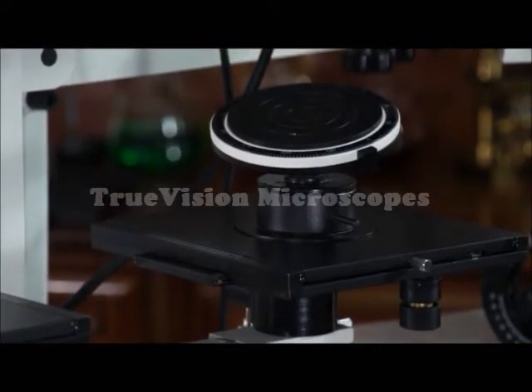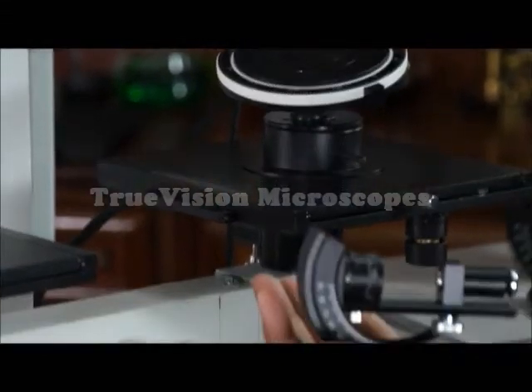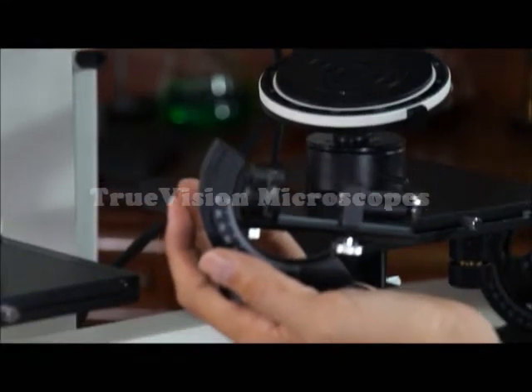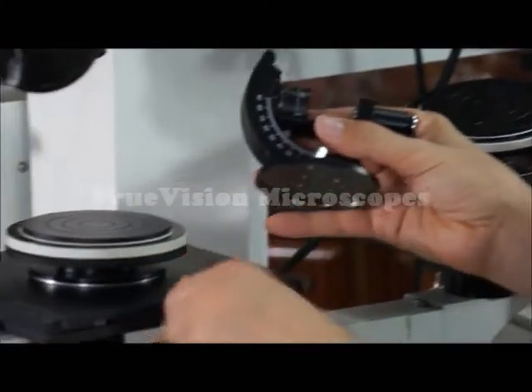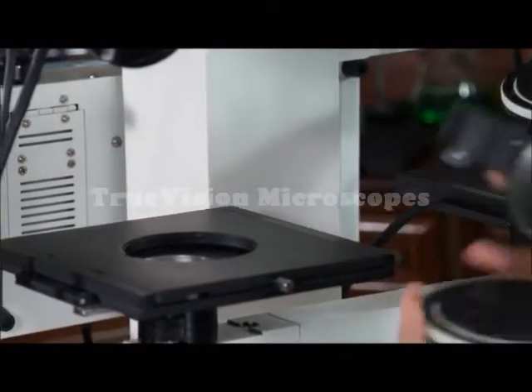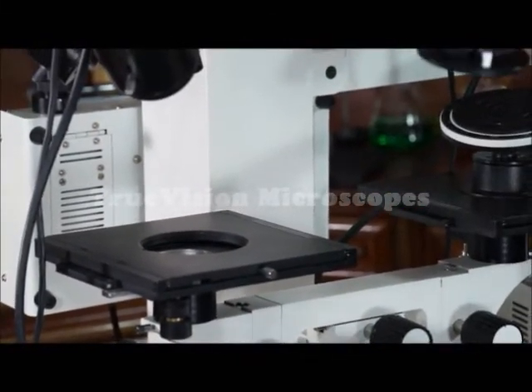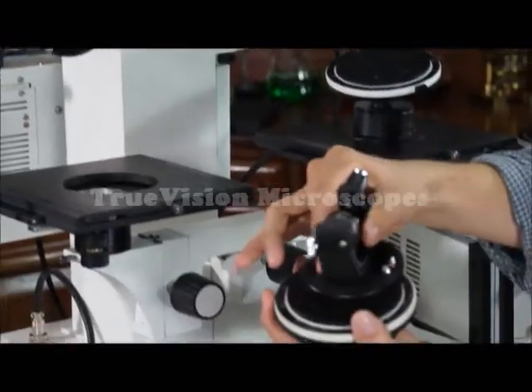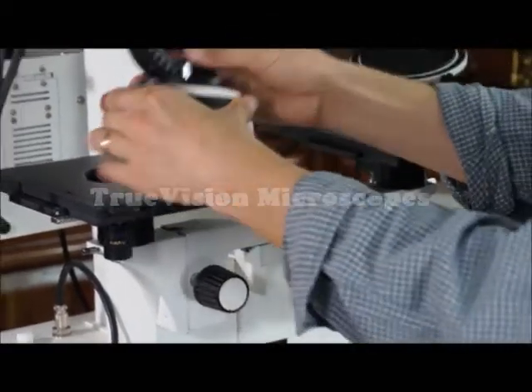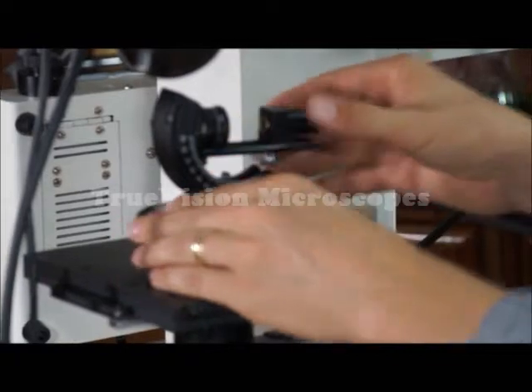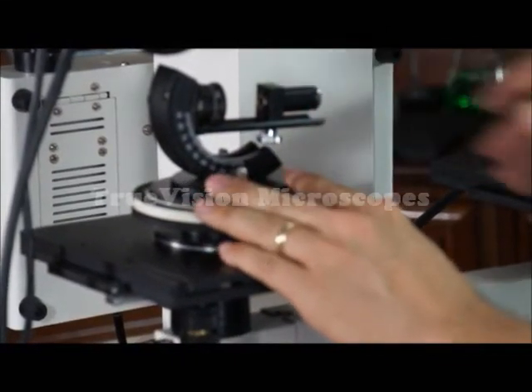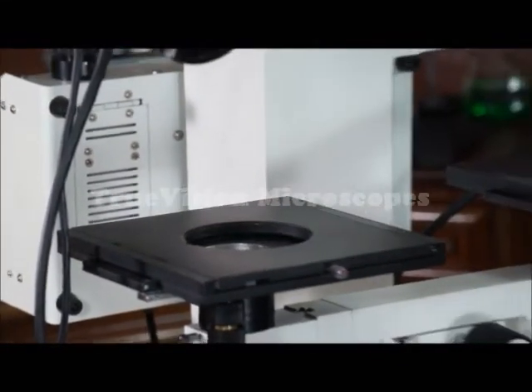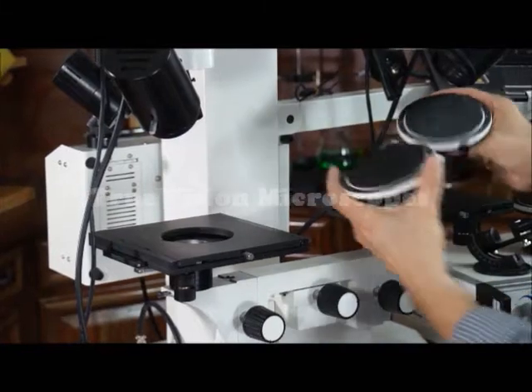For doing bullet comparison, you have the bullet holders. These bullet holders, this is the bullet holder, it's screwed to the stage, there's two screw holes. So depending on your specimen, you have the choices of the stage.